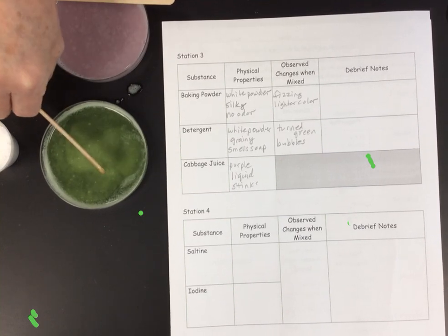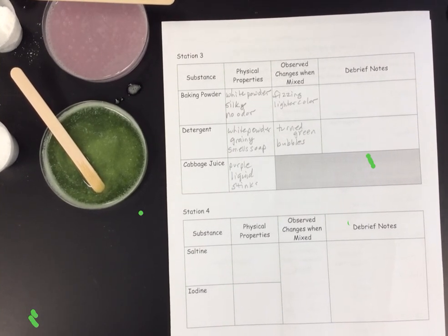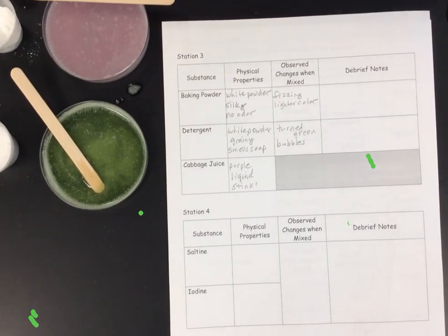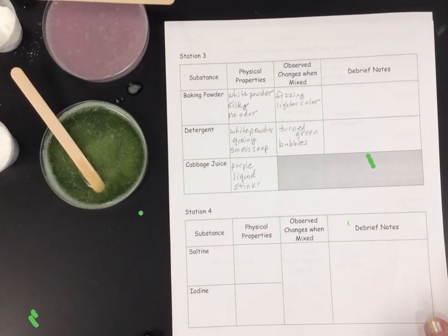But if you look back at this lavender one, the bubbles are still coming up to the surface and popping. It's almost like little tiny volcanoes. All right, that is how to fill out your observations for stations 1, 2, and 3 of this exploration lab.